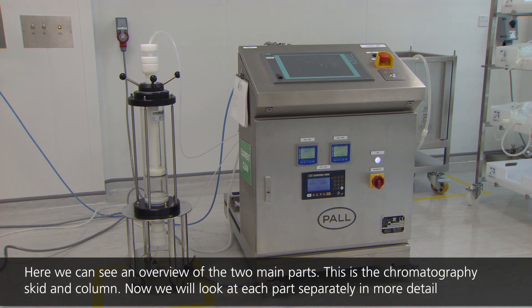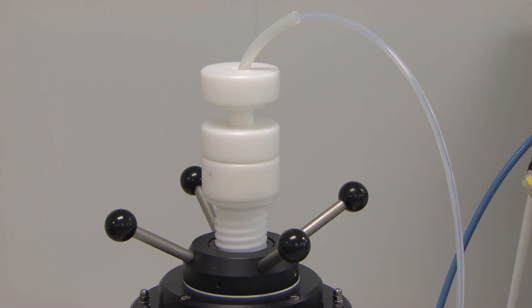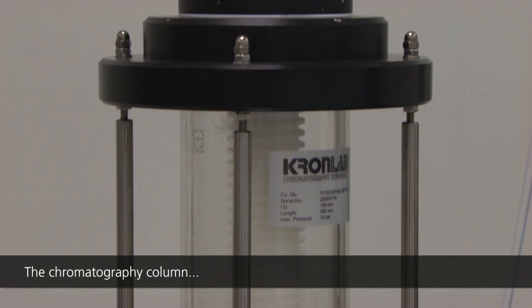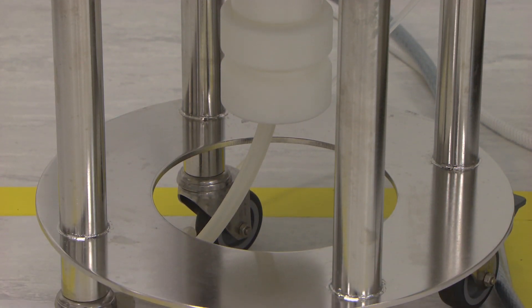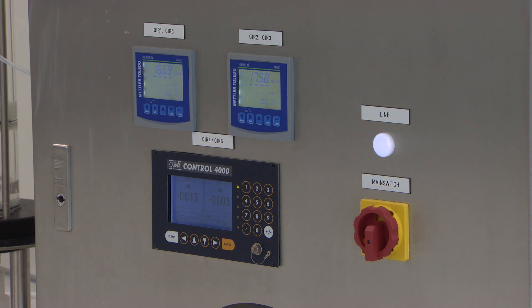Chromatography operations are performed on a chromatography skid which consists of two main parts: the column, shown here on the left, and the control system, shown here on the right. The column consists of a threaded piston contained within a toughened glass housing which can resist pressures of up to 10 bar or 145 psi. The column is filled with chromatography resin which will form the stationary phase required for purification of our biopharmaceutical product.